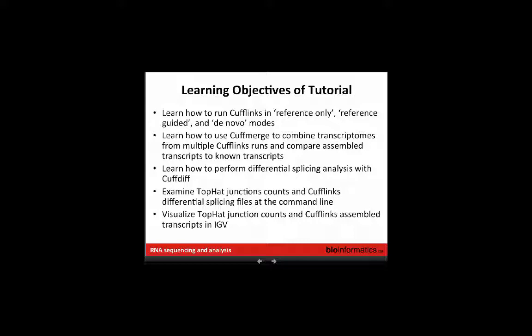We'll also go back to the TopHat output, which produces a junctions count file — a more focused approach on counts for exon-exon junctions. This can be quite revealing for detecting alternative splicing patterns without running Cufflinks. You can focus on specific exon skipping events by looking at read support for each exon connection. TopHat outputs this at the end of alignment. To make results interpretable, we'll visualize junction counts and different Cufflinks-assembled transcripts in IGV, and experiment with IGV's Sashimi plugin for nice visualizations of splicing patterns.